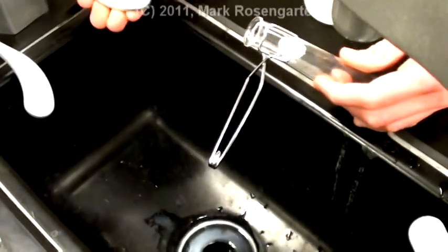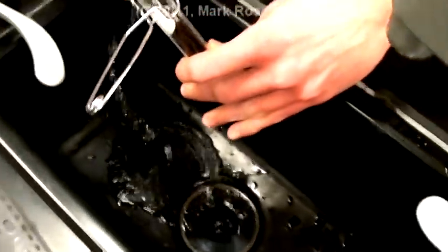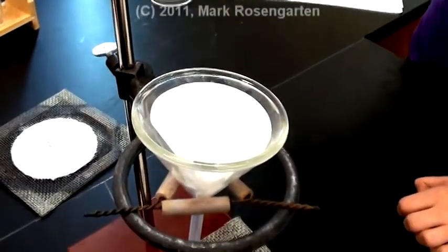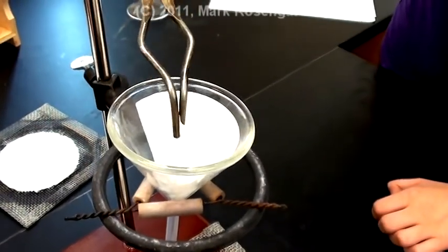You can then dispose of the rest of the stuff in your test tube and give it a good washing with scrubby brushes. After the filtering process is done, the filter paper can then be removed and thrown in the red disposal can.